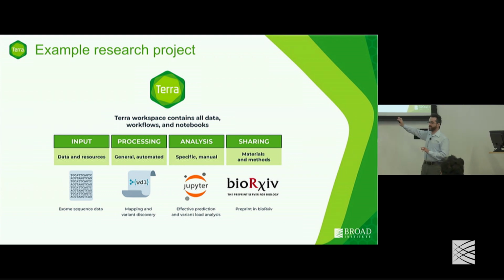So the contents of this slide represent the contents of an example workspace. For example, let's imagine a workspace in which we have our raw data, so it's exome sequence data, and the Terra workspace actually provides you with the ability to upload this into a Google bucket.